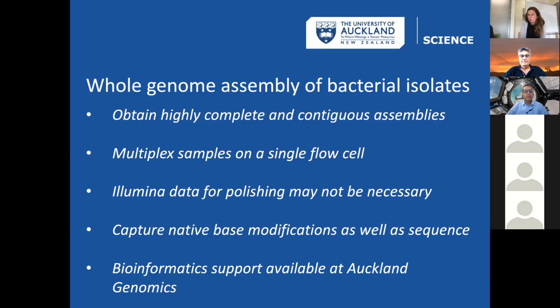As Warren has said, we can look directly at base modifications, and we can support you with that at Auckland Genomics, and we can help you with the bioinformatics if that's something that you would need.